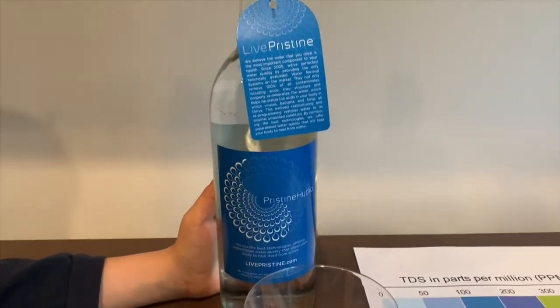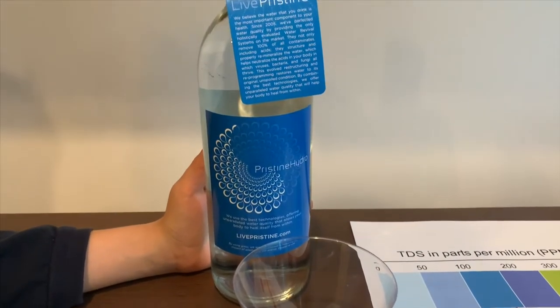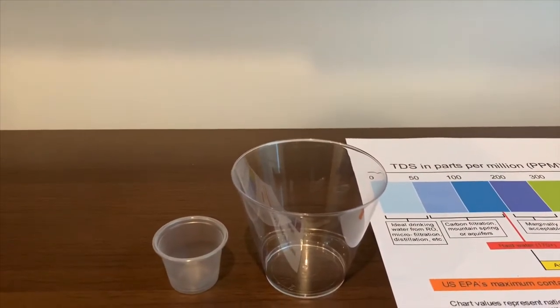This is Pristine Hydro Purified Water. It costs $4.49 and is sourced from municipal sources. Let's test the pH and TDS levels. This is the most expensive vial we have purchased.